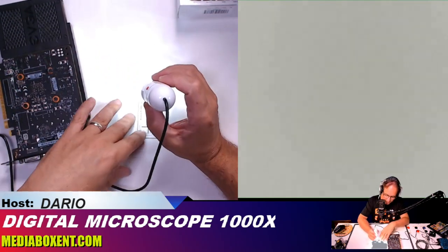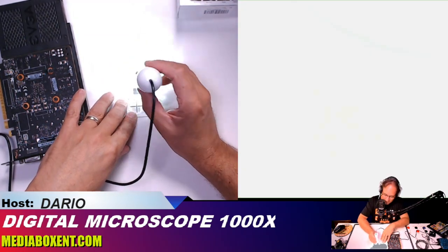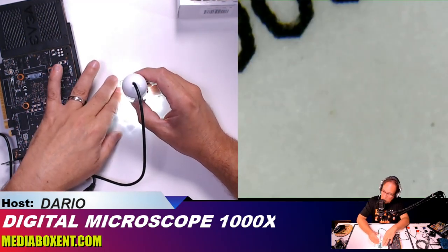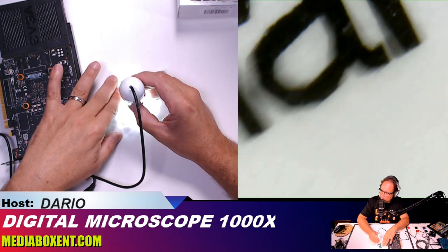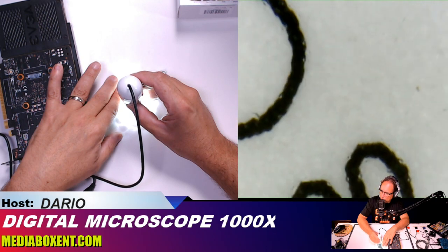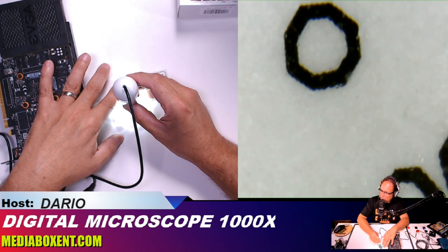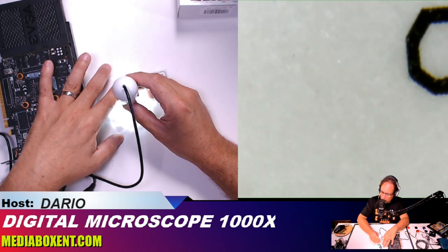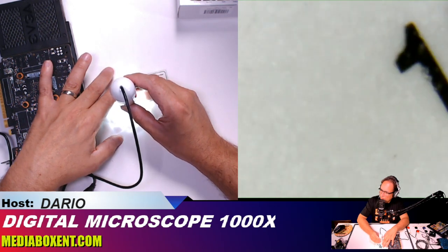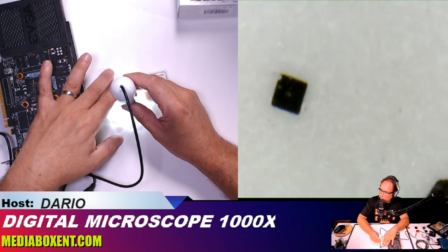Now we can see the measurement chart. I can't even see those by the naked eye, but the chart gives us some measurements. You can see measurements up to 600, and markings at 300, 200, and 100. There's a dot somewhere around there — that must be the one.